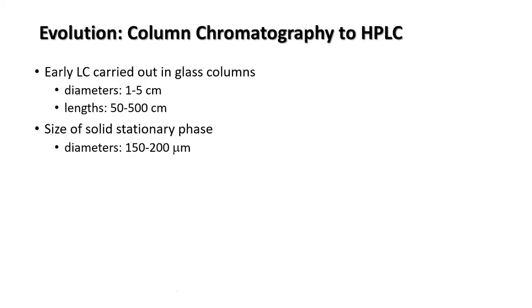Why we use this particular size is that if you have the silica packed, and you don't have a suitable particle size, the problem is that if you add solvent, the solvent will not flow very fast. So if you have a suitable particle size, you can have different kinds of packing of the particles.